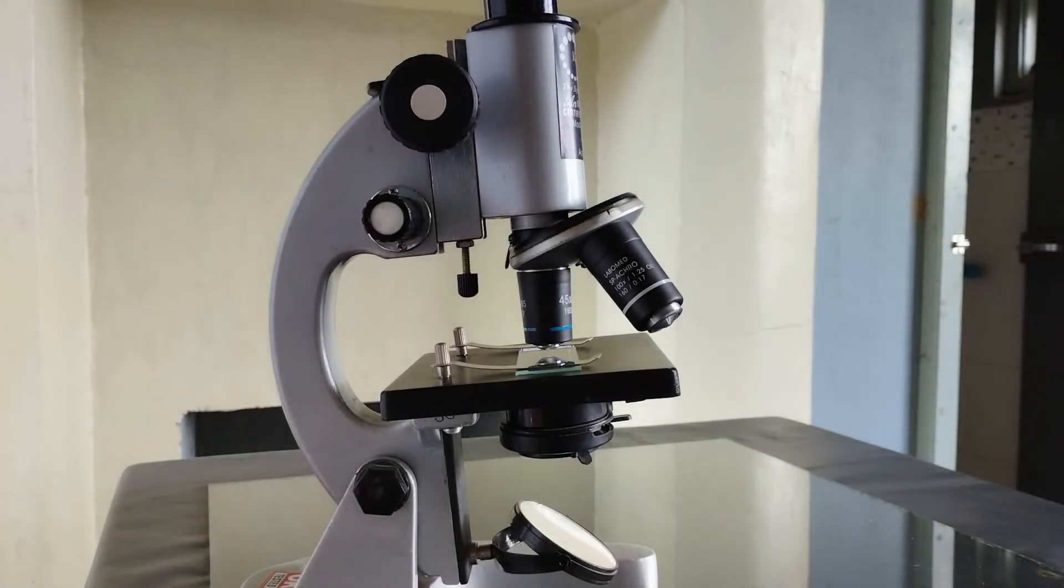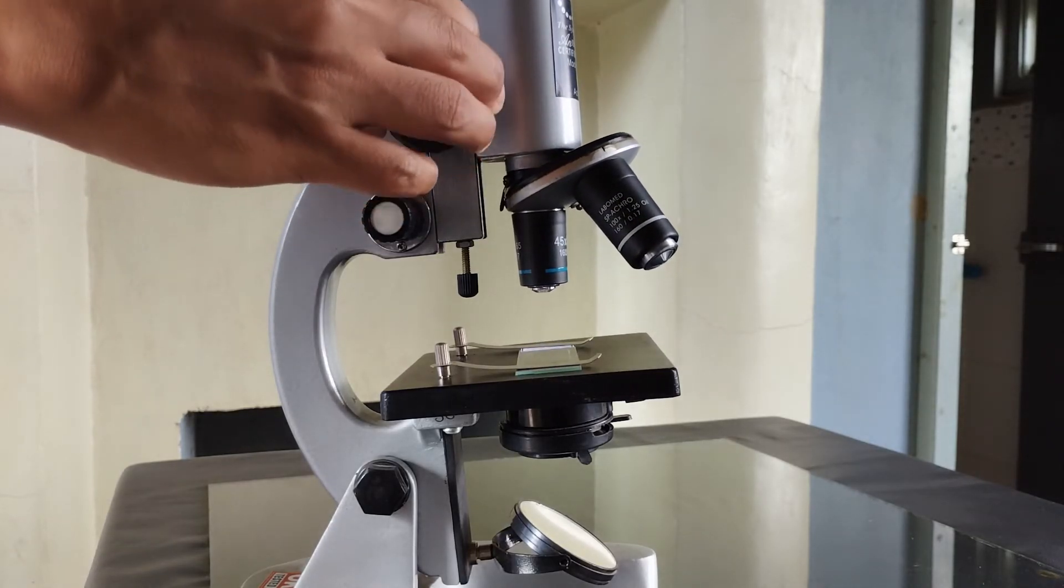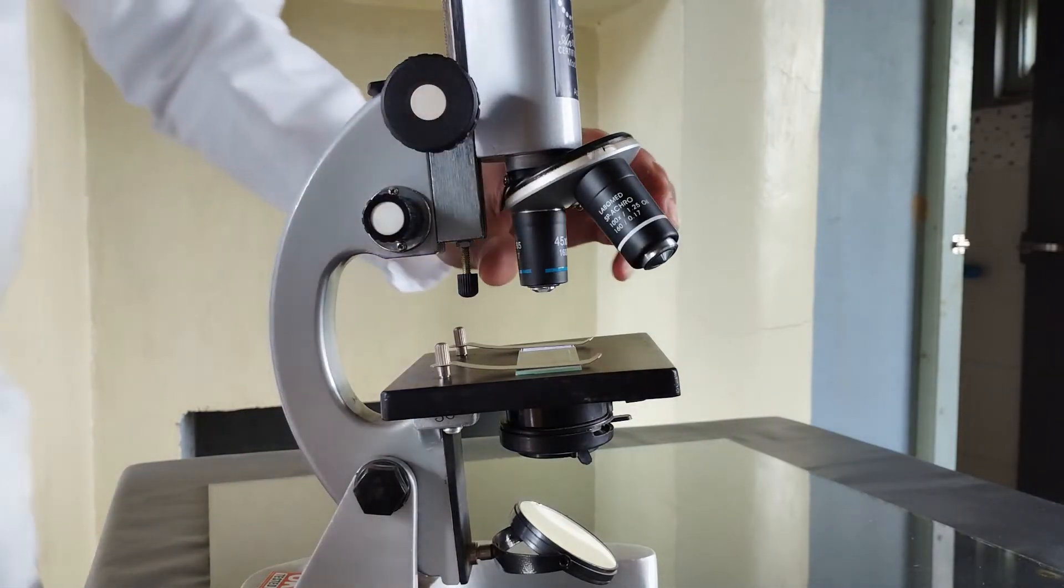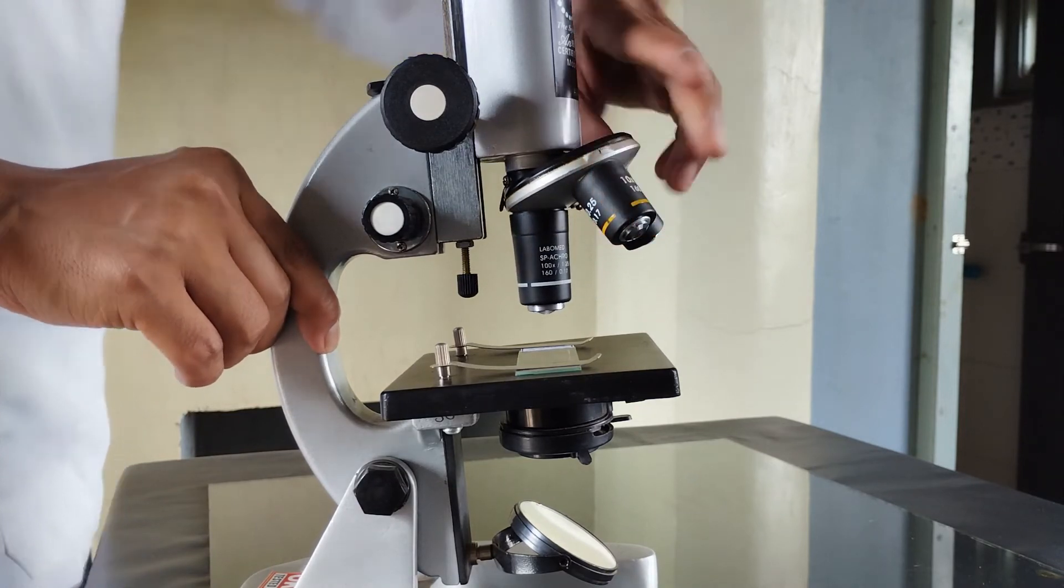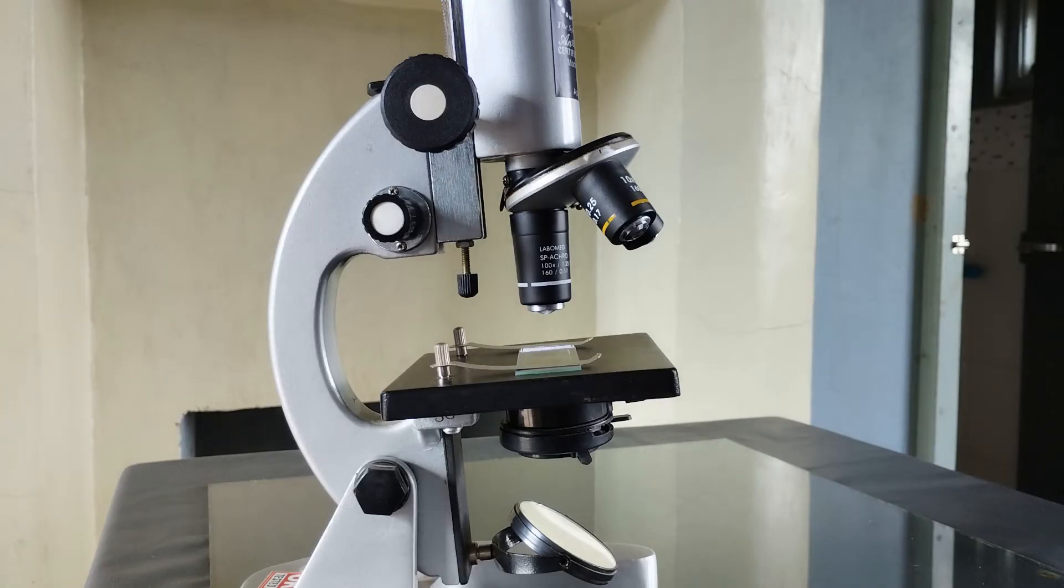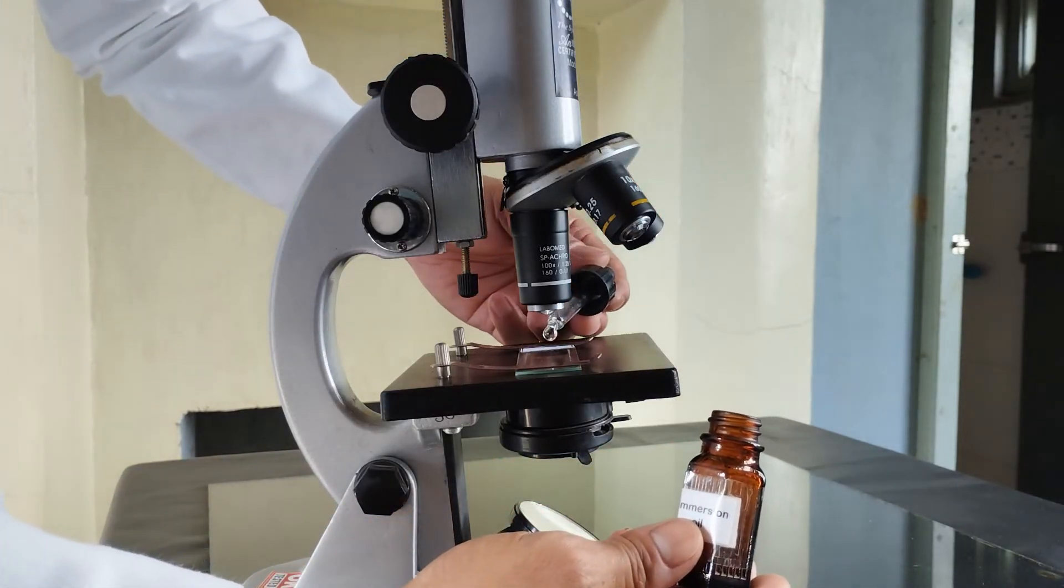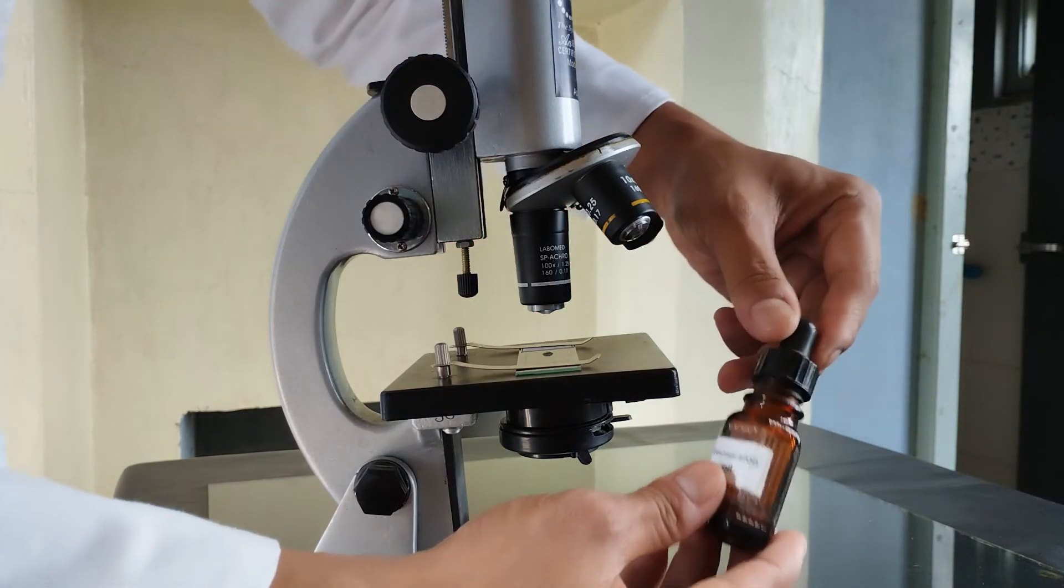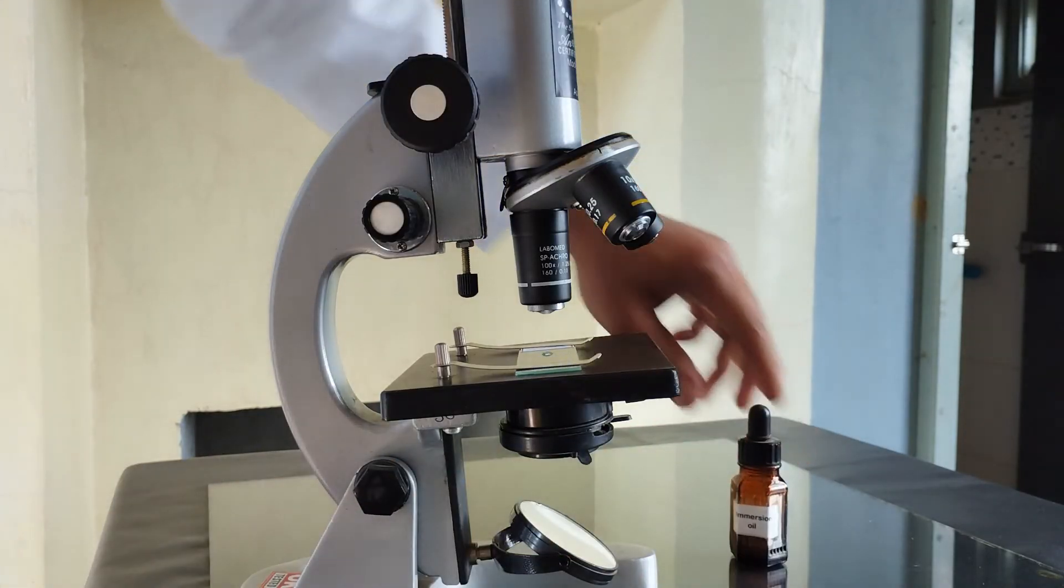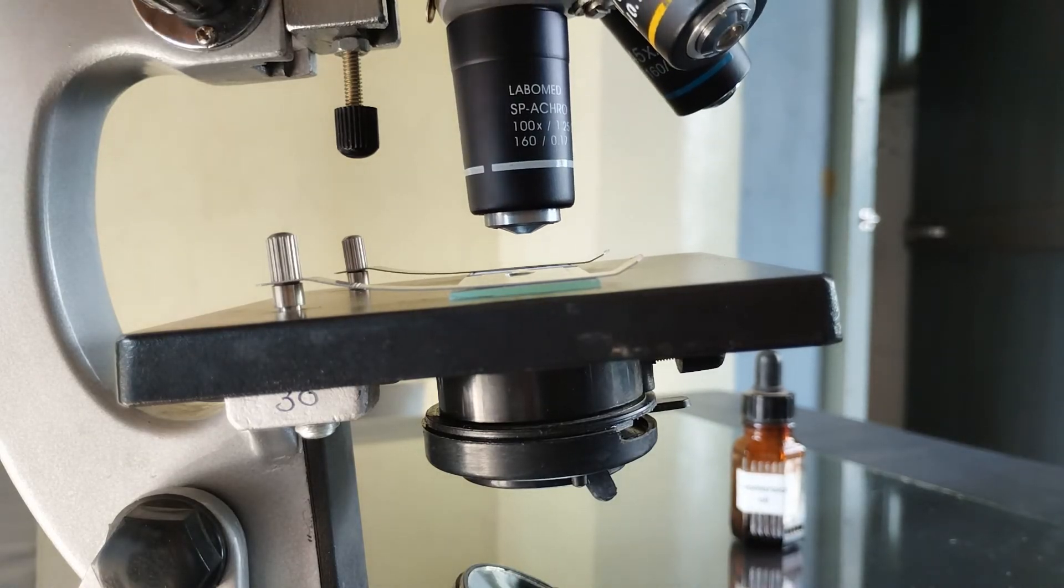In order to use the oil immersion objective lens, lift the body tube of the microscope fairly high up using the coarse adjustment knob, then rotate the nose piece until the 100x immersion lens aligns with the body tube and clicks into position. Place the permanent specimen slide onto the stage and center the specimen. Now place a drop of high refractive index immersion oil recommended by the microscope manufacturer to be used with their immersion objective.